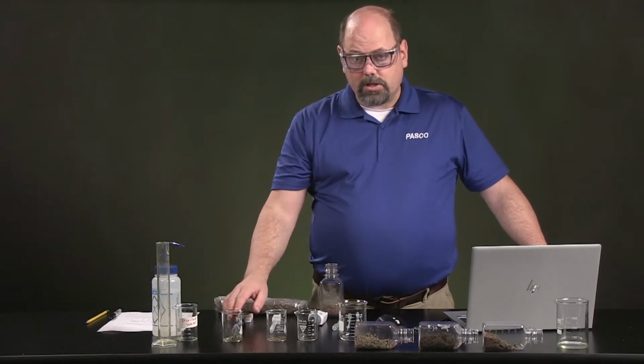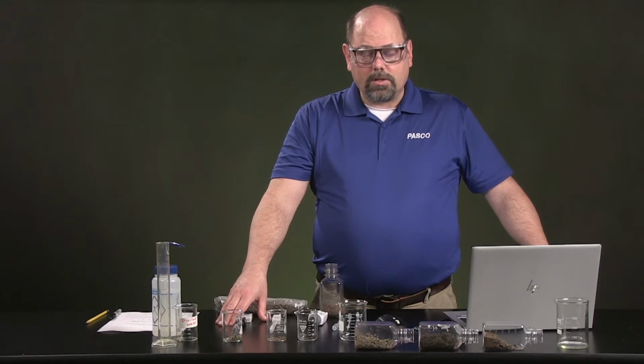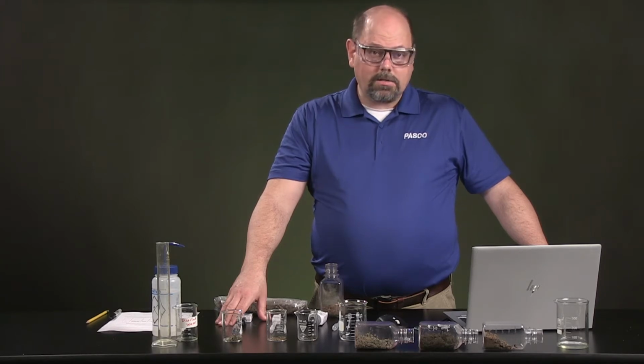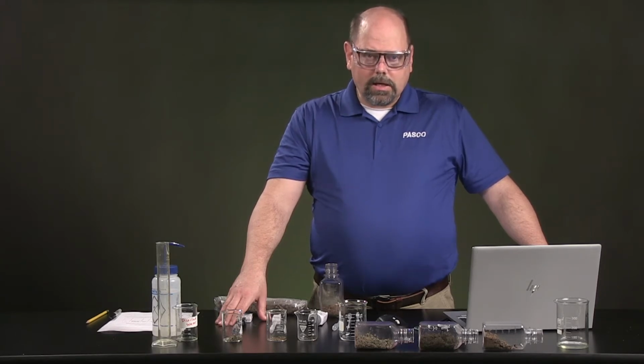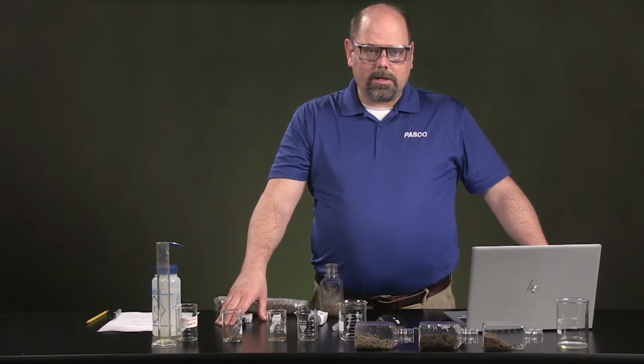Some of the minerals may change the pH. Some of the plant materials can change the pH. And so, if you're in pine forests or some of the leaf materials that can fall in there have tannins, which are going to be more acidic, and the soils might have something more like limestone, which is going to be a little more basic. So we'll determine that here in the experimental measurement portion.